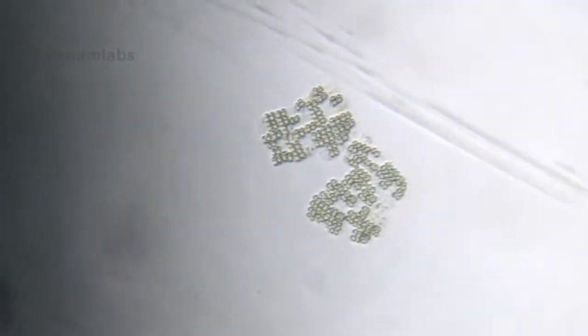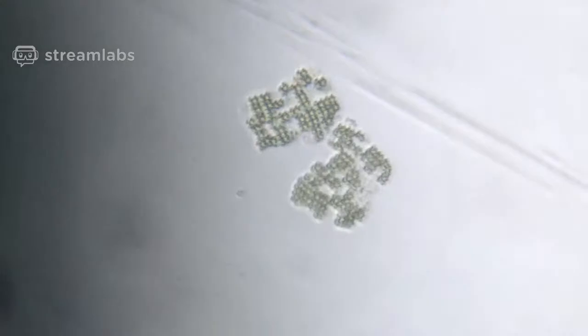Okay, this is actually very easy to maintain. All you need to do is, once you find a Merismopodia, you take it from your slide and put it into any kind of container, and then you put some soil in it. They generally tend to grow in it. Of course, there are more techniques.